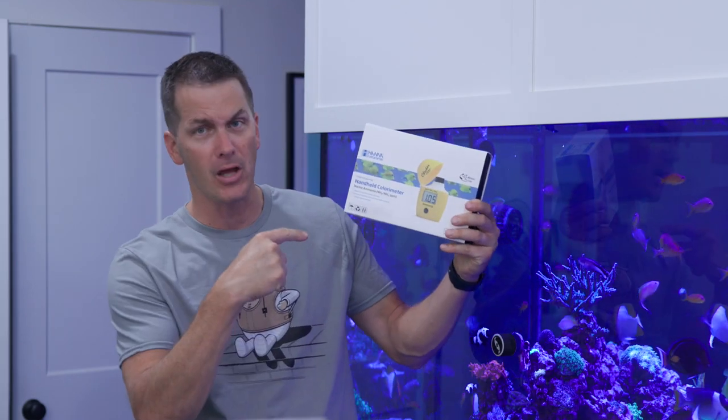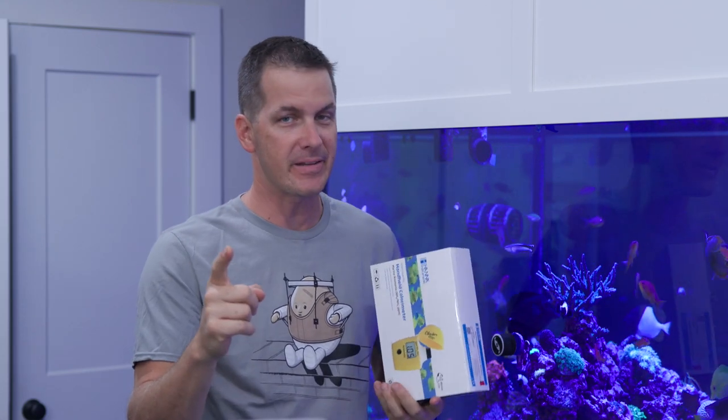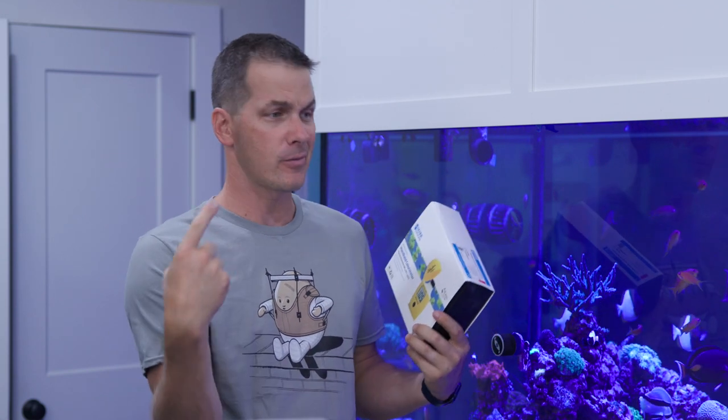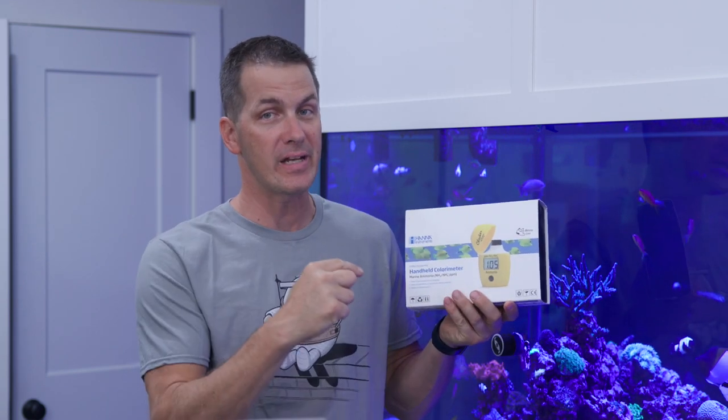Taking our first look today at the Hanna Ammonia Checker. The first thing you may be thinking — which is what I was thinking — is when was the last time I checked ammonia in my display tank? Honestly, I've never checked ammonia in my display tank, or really any of my display tanks. Why? Because I cycle my tanks with live nitrifying bacteria and I never see an ammonia reading — all I get the next day is a nitrate reading. That said, there are some places where I can see using the ammonia checker.